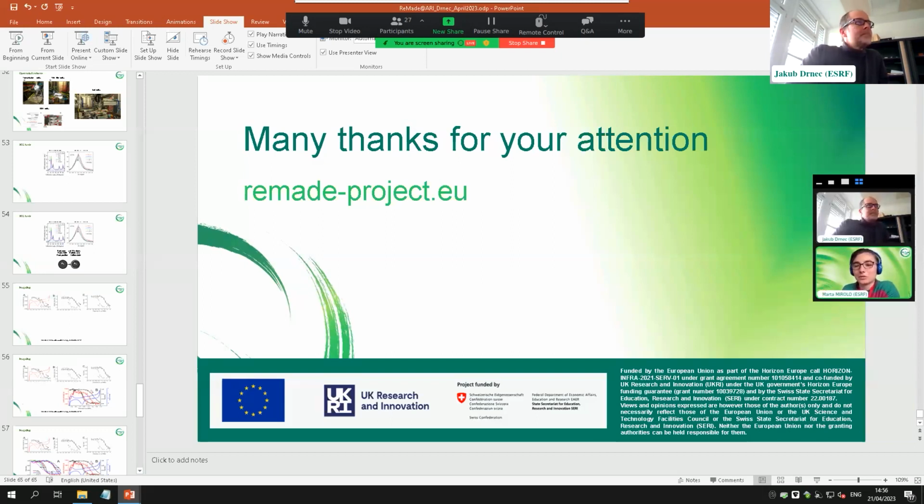And just to give a bit of an example to users, when they apply for beam time at the ESRF, what is a reasonable amount of time that they can ask for? Are we talking about hours, weeks?